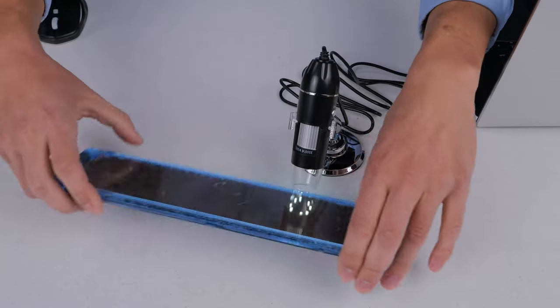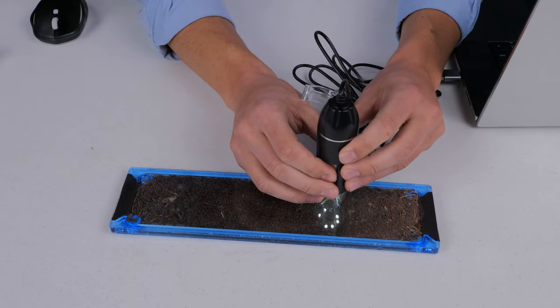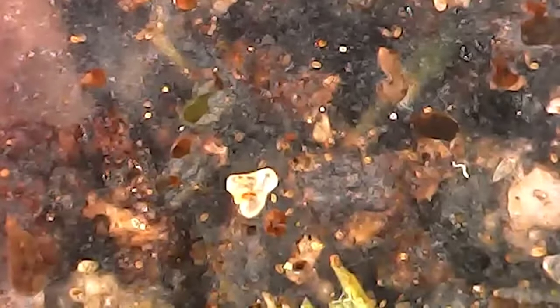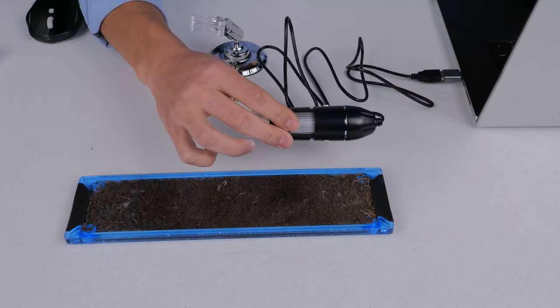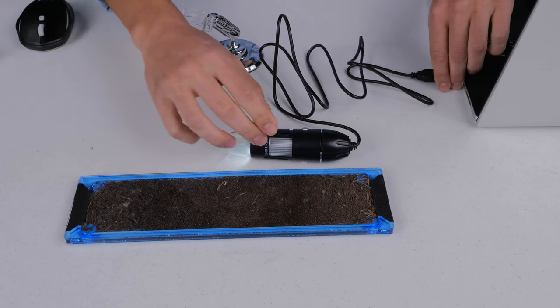Let's look at the Micro Safari Terra cartridge — this is our new experimental fill-it-yourself version that I'm excited to talk more about once it's fully developed. This is from the local park; let's see if we can find some springtails. There they are — they look pretty cool. The image does seem a bit overexposed but I can adjust that in camera settings. Overall verdict: not actually all that bad. I was expecting to give it a worse review, but I don't mind this.